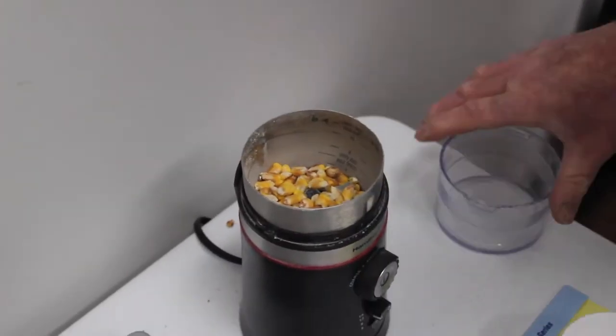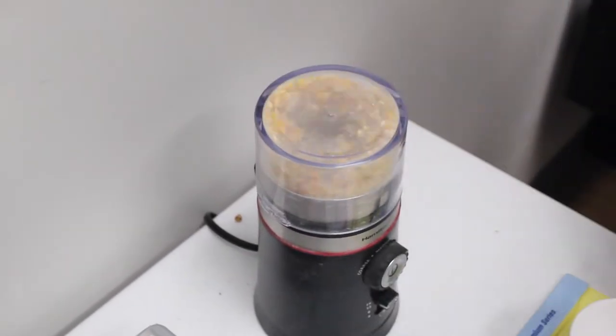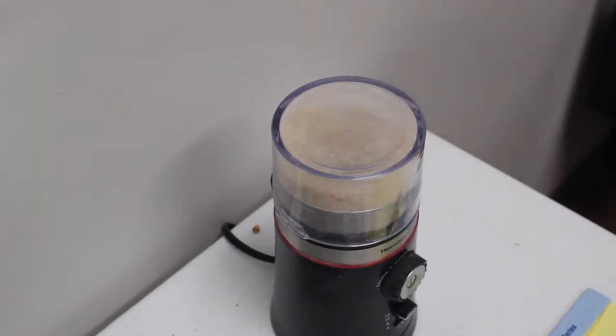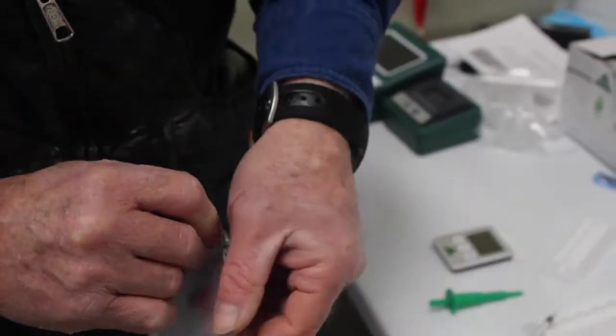Once they get the size of sample they need, they will take this sample and grind it into a coarse powder. The coarse powder is then placed in a specialized filter bag.